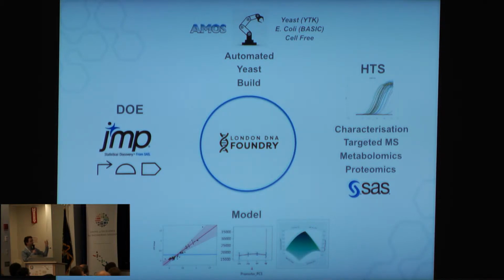The software platform I've built is not quite a LIMS, not quite a driver, but what it does is take the context of the experiment as designed by the DOE and turn it into something that's automatically made on the work cell system. For example, if you want to make 1,000 designed organisms, we're talking about around 15,000 individual liquid transfers in and out of about 14 different assays, which isn't a lot if you come from high throughput screening like me. But as these signals multiplex and come together in and out of different size plates, that software platform really had to be developed to do that.